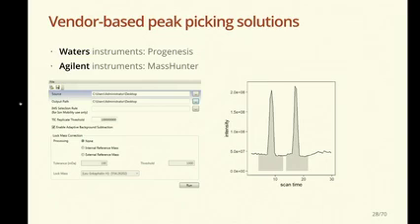analyze or do two sample measurements in a specific sample, then we can first split the file into two separate sample measurements, two separate burns, for example, technical replicates. And then in the software, we can either do an external lock mass recalibration, do some adaptive background subtraction, all very intuitive to use.